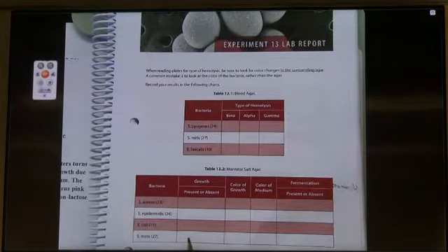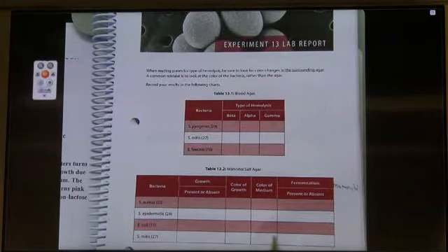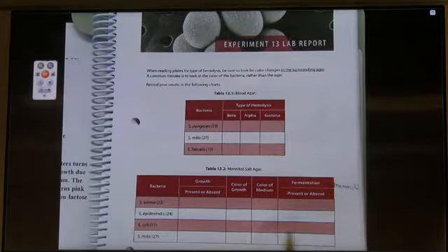The other two, NA, not applicable, both 11 and 27. Let's do them together, please. Not applicable, throughout. In all columns, please put down not applicable, not applicable, not applicable. Because they are non-halophiles, there was no growth. Okay? Now we move on to the next plate. That was McConkey agar.